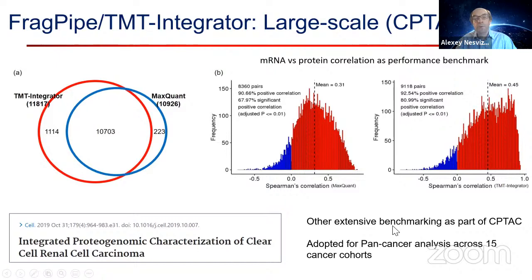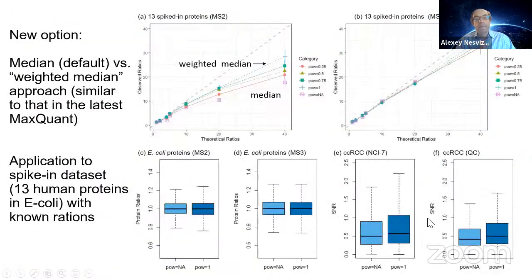Now, running out of time, I really cannot talk about this new option that we tried, that MaxQuant has, a weighted median approach that works better in certain cases.